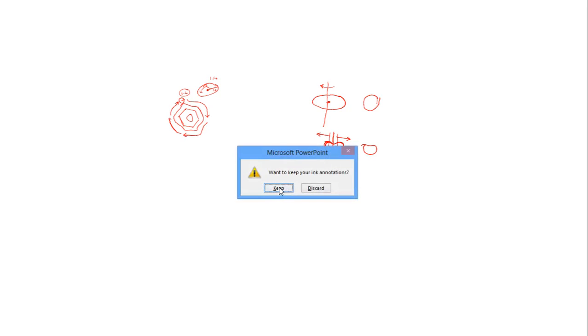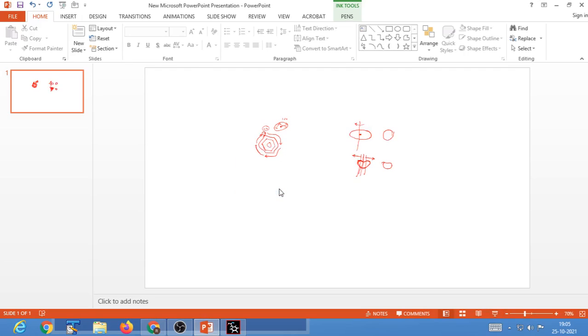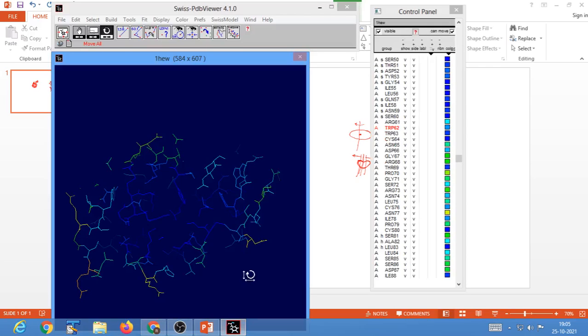Now I will show you, you can move the slab towards this side, as well as towards the other way around. So you can take thin cross sections like this by moving the slab away or towards you. Let me show you how this works. You can move the slab towards or away from you so that you can take a thin cross section of your molecule.